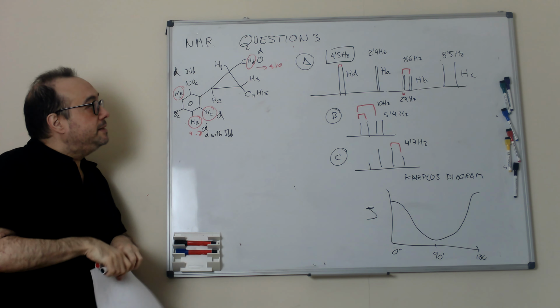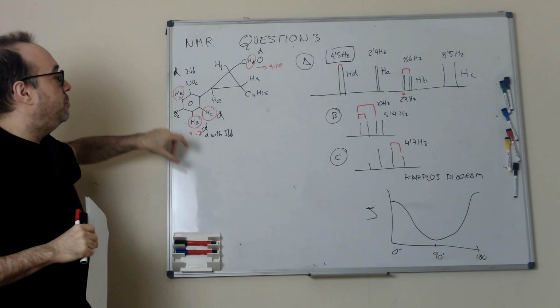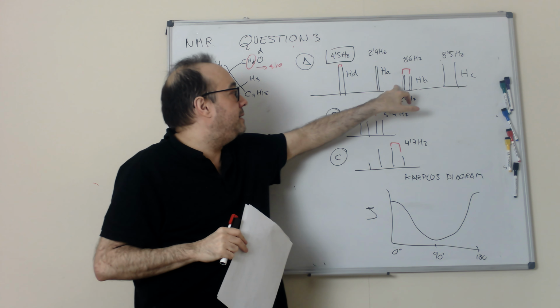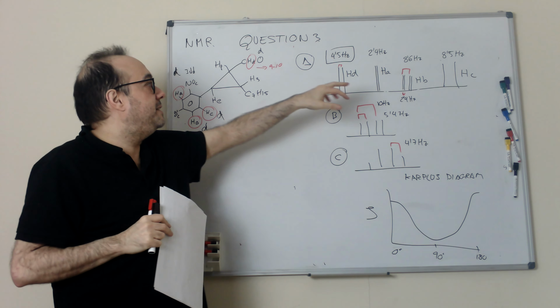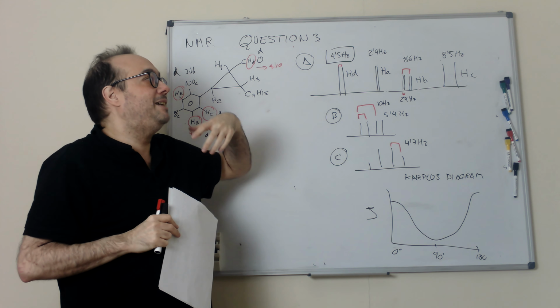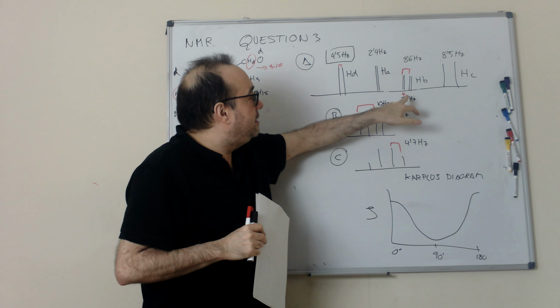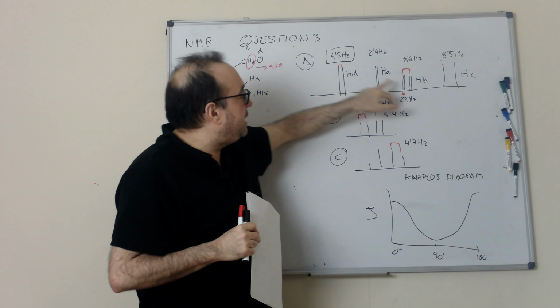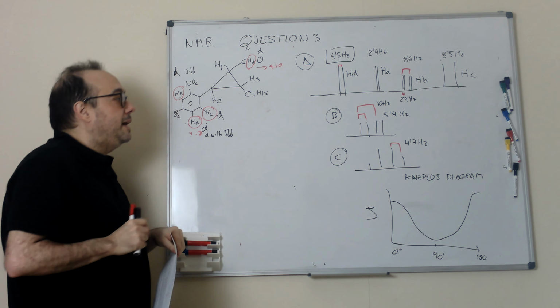This has been easy. Check that the coupling constants correspond to the structure that we saw. HC-HB is the same coupling constant as HB-HC, 8.6, 8.5, more or less the same. Remember that it's very difficult for it to be exactly the same number. If they are similar, they are okay. The narrow coupling constant is 2.4 for HB-HA and HA-HB, and then we have the aldehyde.